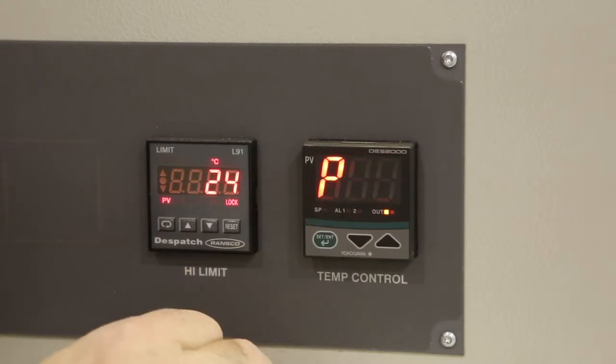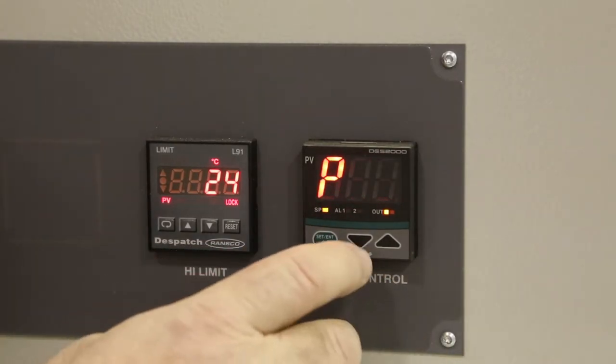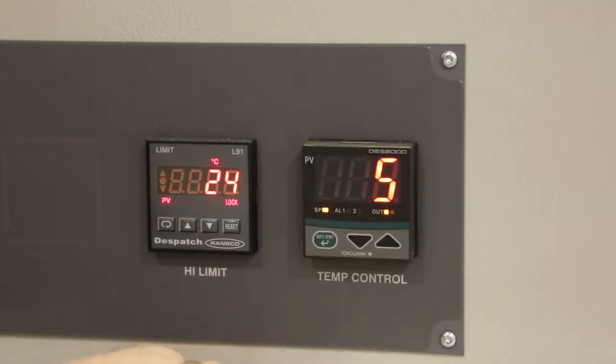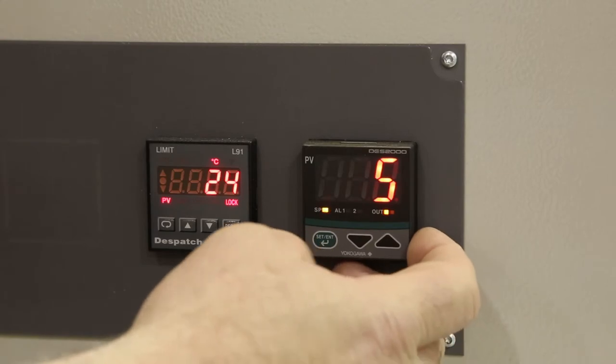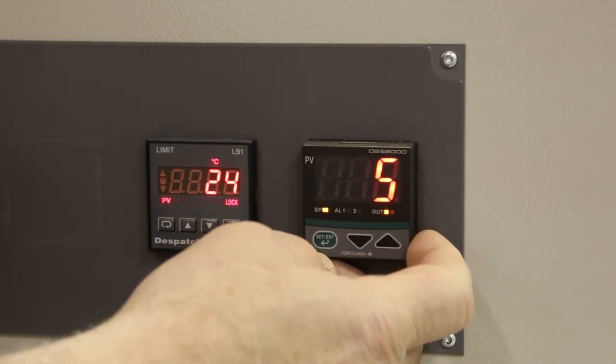Cycle the green button until you see P displayed for proportional value. The proportional value for centigrade operation should be 5. For Fahrenheit operation, it should be 13.